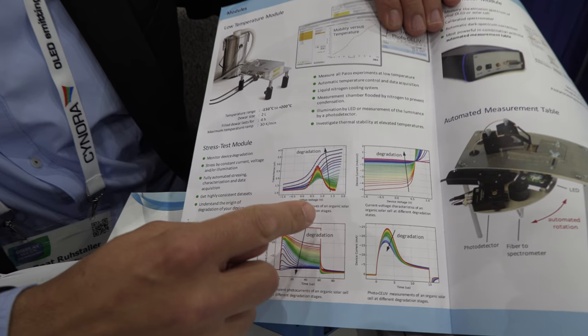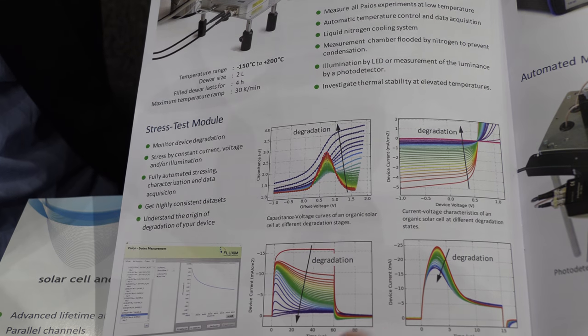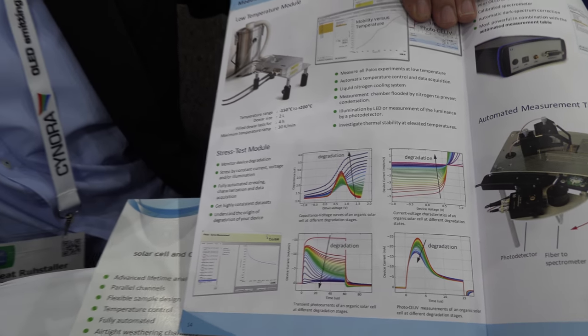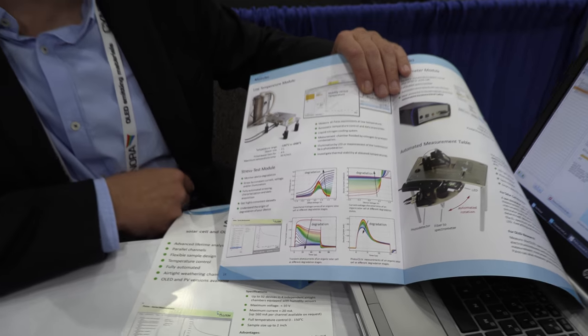You see that there's a systematic change from a fresh to a degraded device and by doing more than this simple decay curve, we can actually try to understand the customer, understand why his OLED device is degrading.